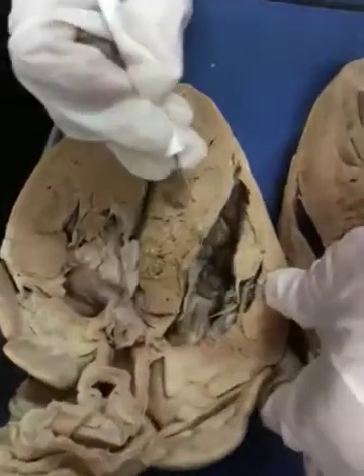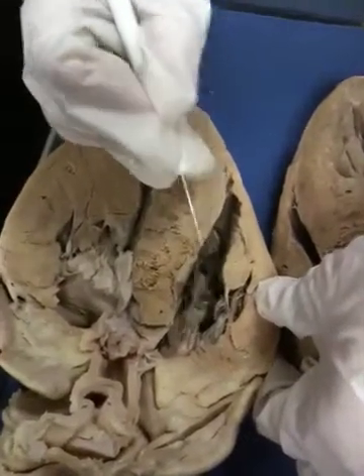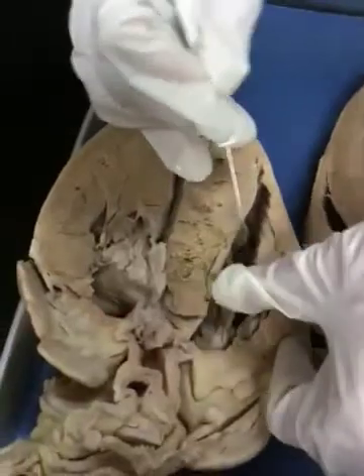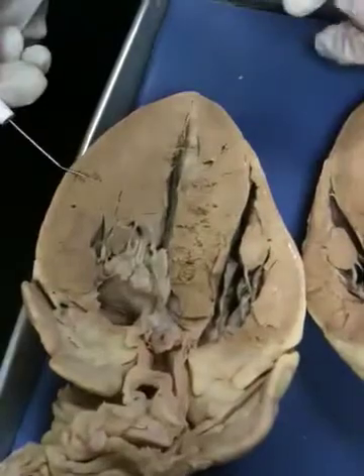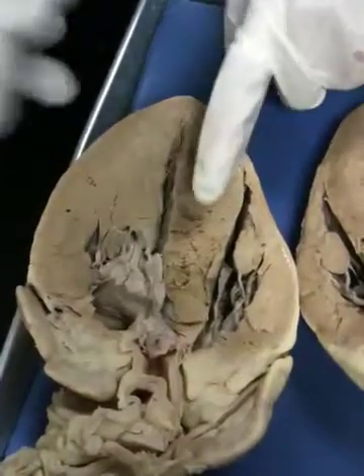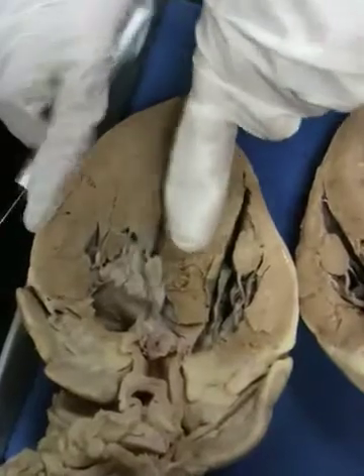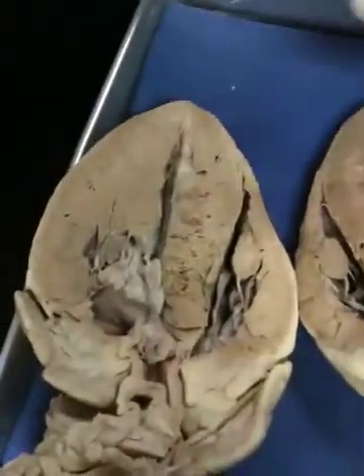On the right side, we're looking at the tricuspid valve. It's been ripped a little bit, but that's okay — the cords are here and they're nice and tough. Interventricular septum: this structure is part of the ventricular wall, contributing to both the left side and right side. It's pretty thick as well because it does a lot of work.